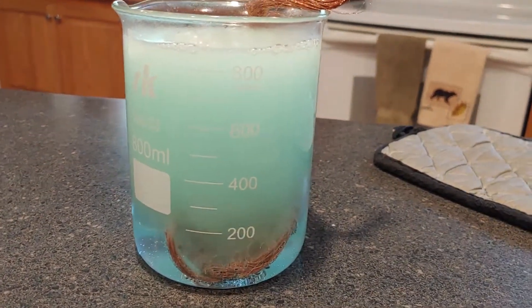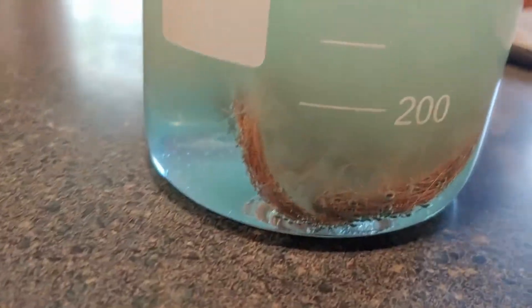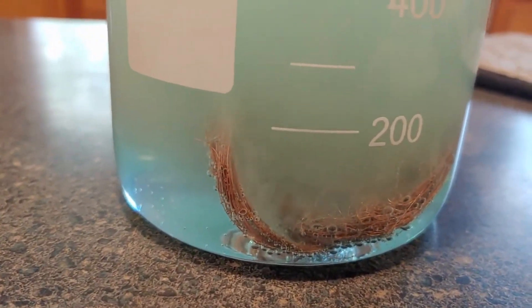This is going to stay overnight like this, but you can see the solution's already turned from clear to green, and that means we have copper in there.